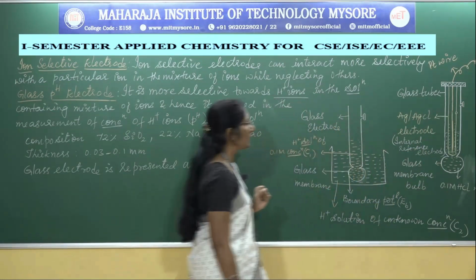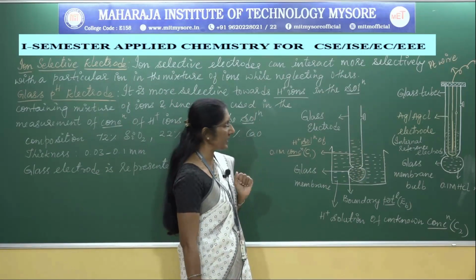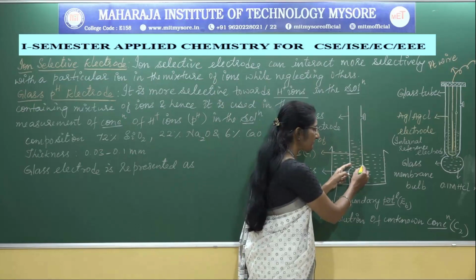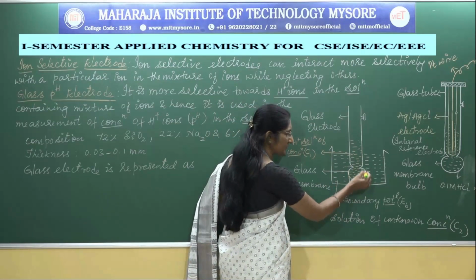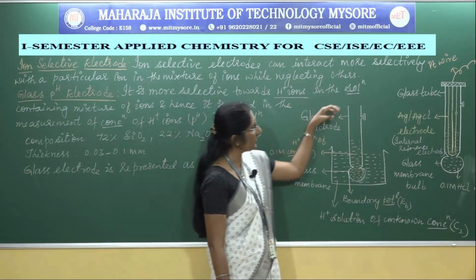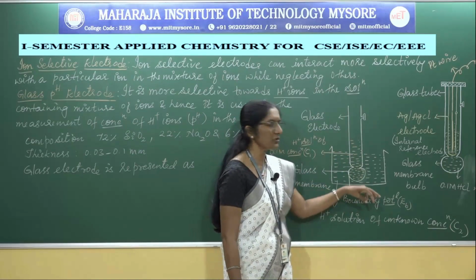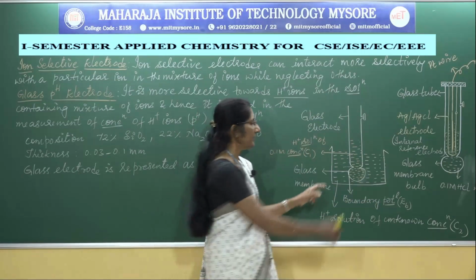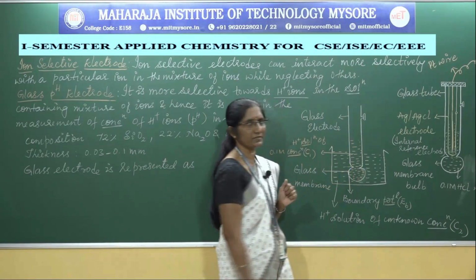Let us discuss the working of this glass electrode. It has a glass membrane bulb, through which there is an exchange of ions. When this glass electrode is placed in a solution of unknown concentration, there is an exchange of H plus ions through the membrane.